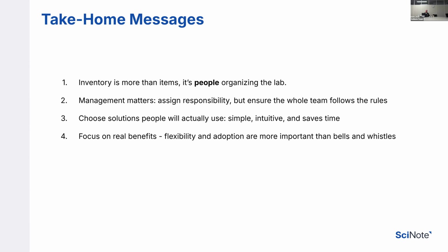So the next poll question will be, what are some of the features where you want to learn more? So if you're an existing customer, I'm sure you're going to see some that sound familiar to you. So just choose one that you want us to do a deep dive on. And for prospects as well, you know what doesn't work today. So that's probably the answer that you're going to choose.